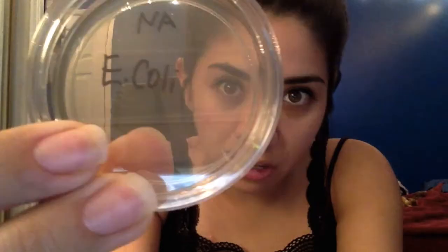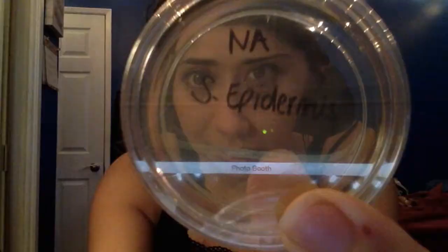Hi, my name is Sarah Saldana, and today's date is January 21st, 2018, and I am just updating. It's been another 24 hours of incubating the 3 different bacterias, the S. cerevisiae, the E. coli, and the S. epidermis, and still, unfortunately, there is no growth of either bacteria seen in any of these quadrants, not even the first, which should have been the strongest for the streak plate method.